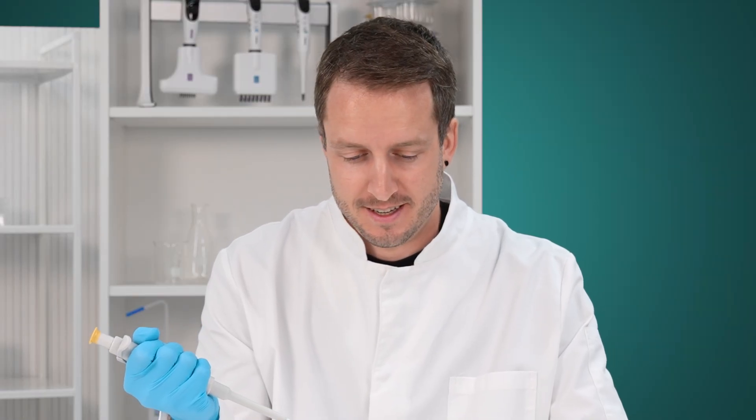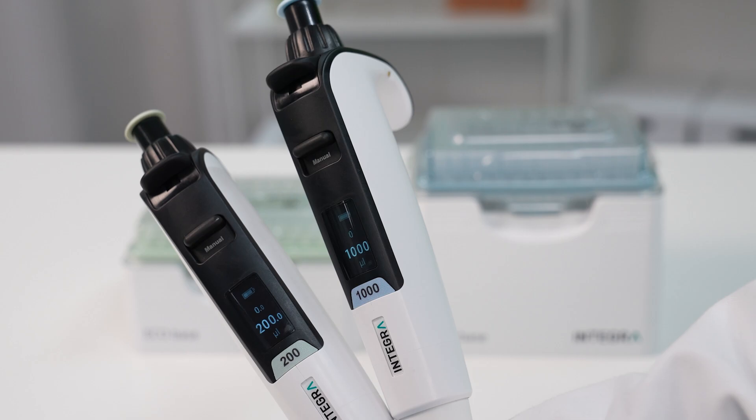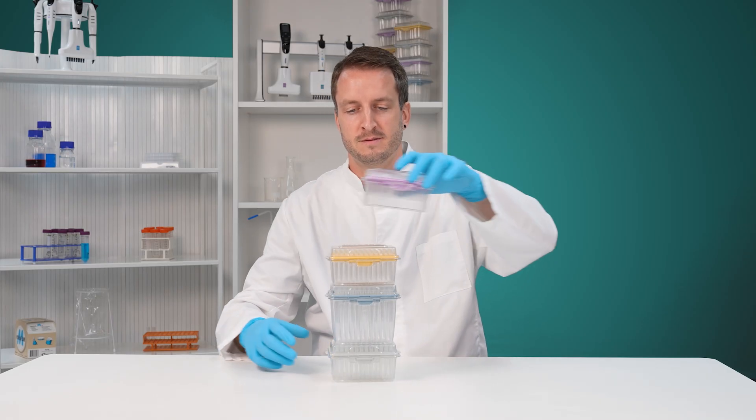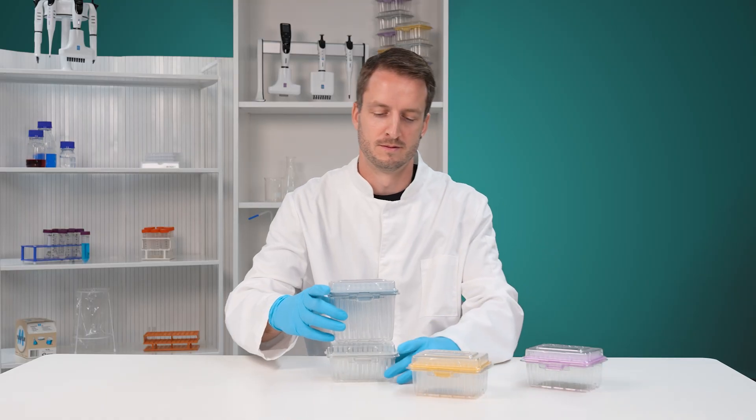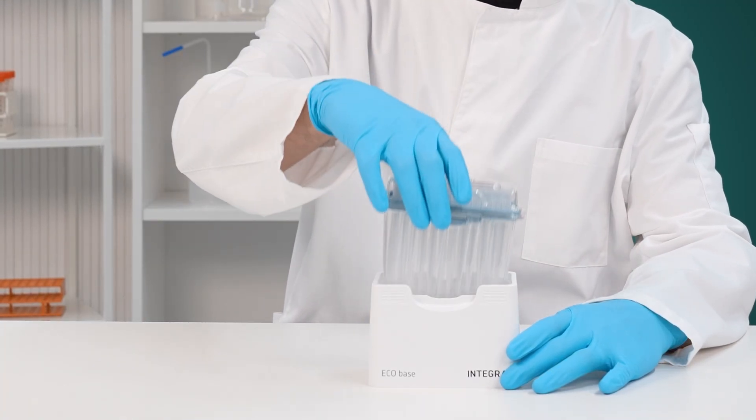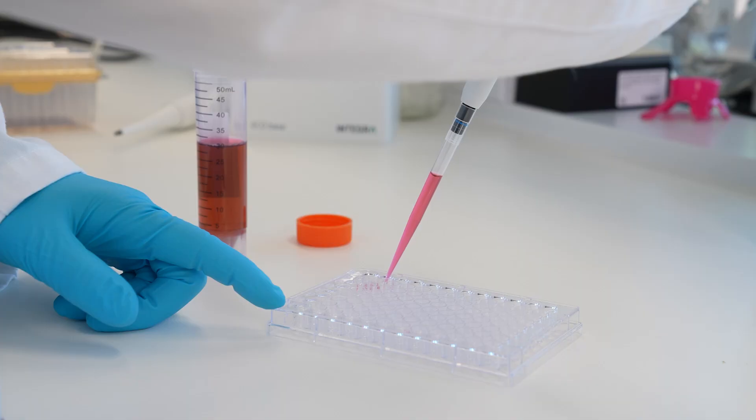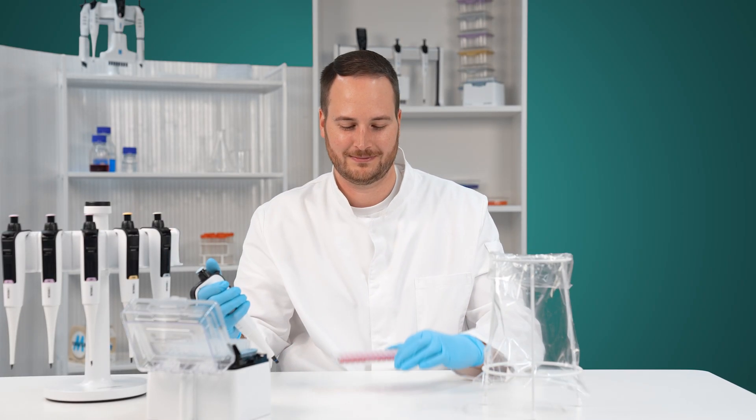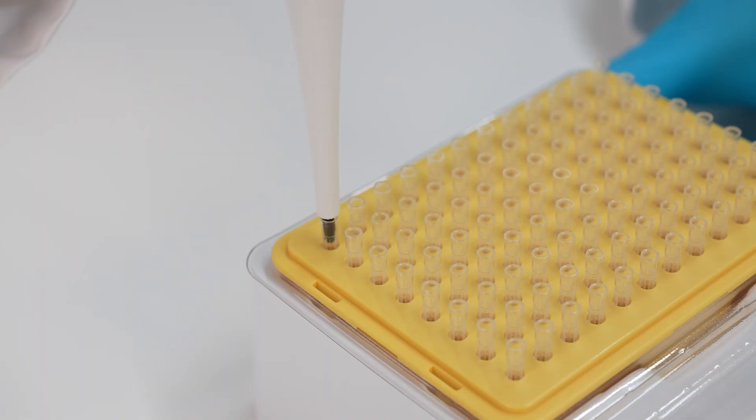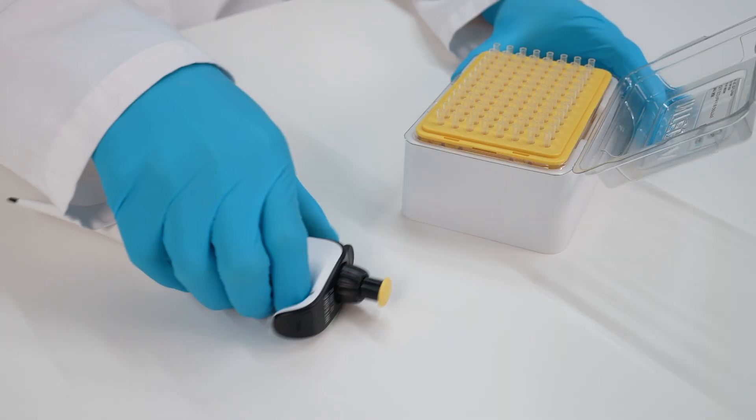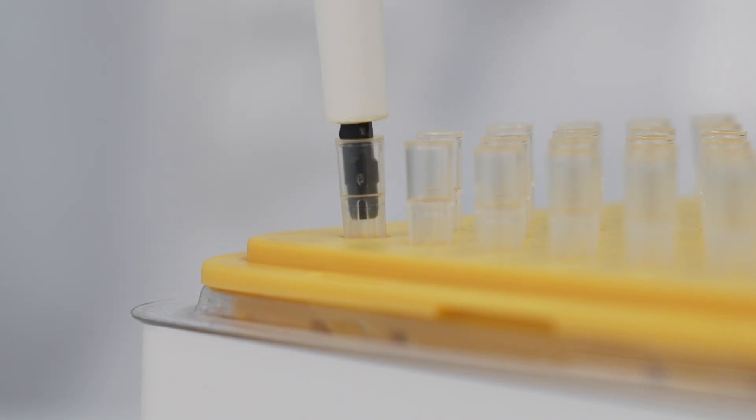Loose tips which leak and fall off? Not anymore. Grip Tips and Switch is a match made in lab heaven. Integra's eco racks significantly reduce the amount of plastic used in your lab and are easily stacked and compressed to take up less recycling bin space. No leaks, no wobbly tips, and absolutely no hammering tips on. Just click, dispense, and relax knowing everything is secure. Oh, and did we mention the ultra-low attachment and ejection forces?